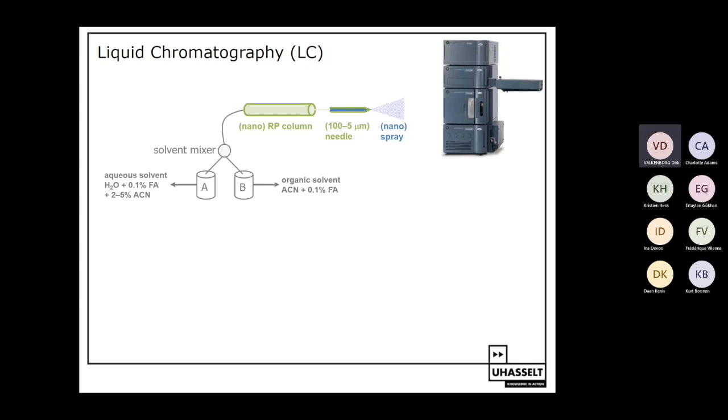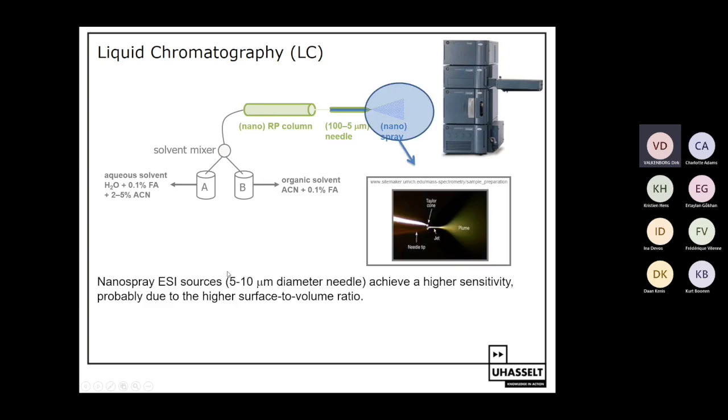And we will do that for a while, until no more peptides elute from the column. And so peptides elute from a column, and then we gradually start to change the mixture of the liquid, and we will make it more oily until peptides that prefer that more oily environment are comfortable to jump into the liquid fluid and will be transported to the needle.